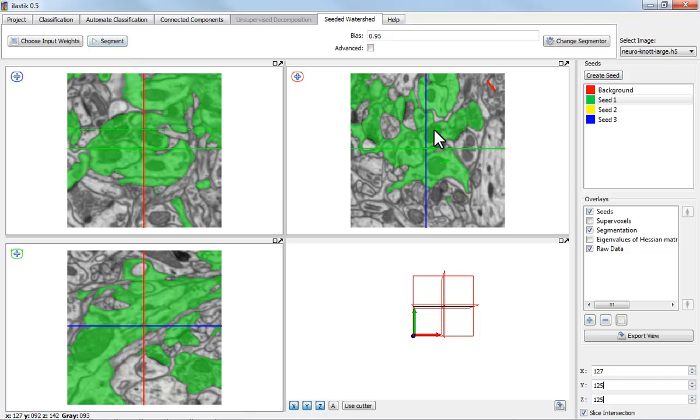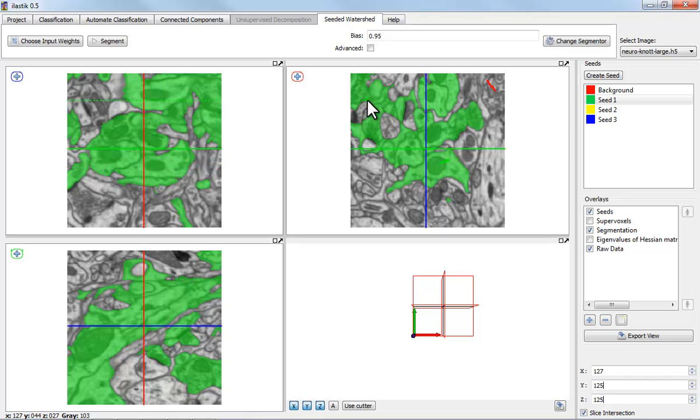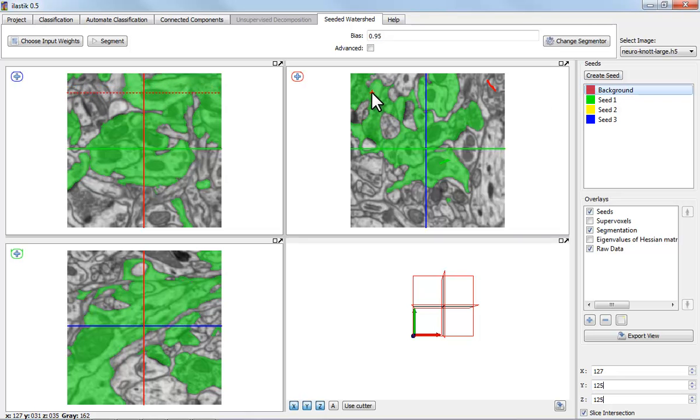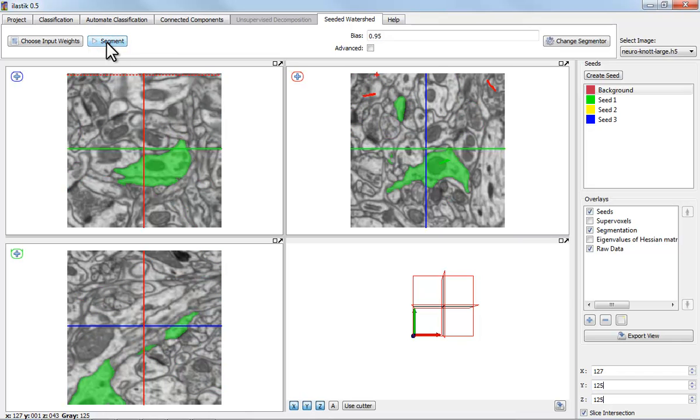Now you see that we've had quite a bit of bleeding here. So, one of the membranes was leaking and so this seed has been leaking out. I can try one of two things. I can either add more background seeds and see if this will solve the problem, which in this case it seems to, or I can play with this bias parameter.